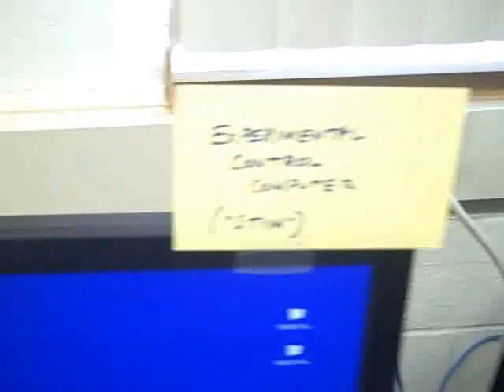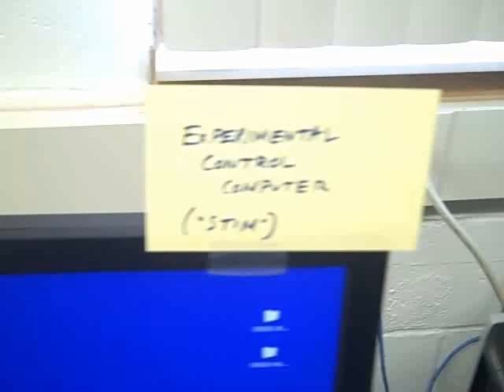Now the next thing you've got is one desktop computer which in this case I've labeled with a little piece of green tape. Green symbolizes the E-prime, that's the color scheme there, and that is of course our experimental control computer. Next, what you have is another computer, which is our physiological data acquisition computer, which I'll just call acquisition. And here it's symbolized by blue, that's the color code for the biopack.